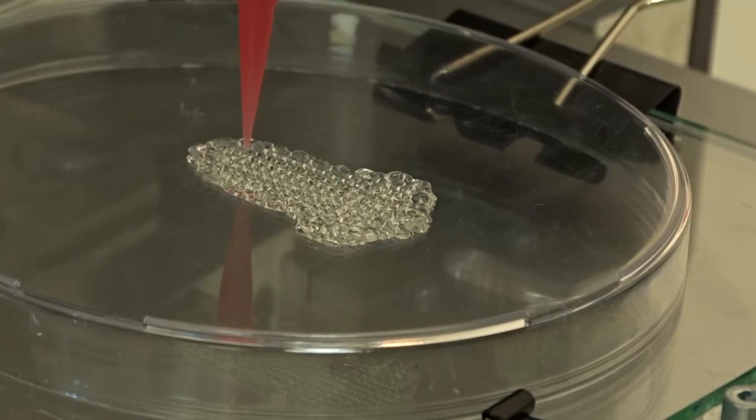We develop and apply the convenience of 3D biofabrication to turn your ideas into operational devices and procedures.